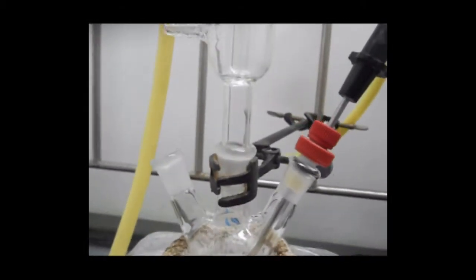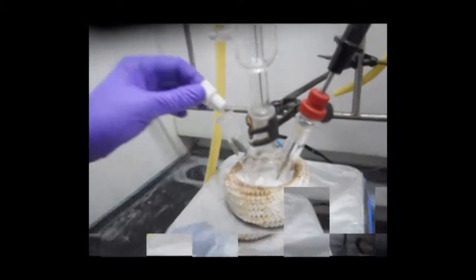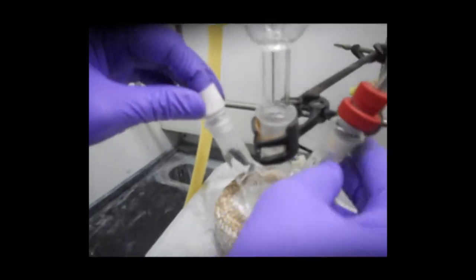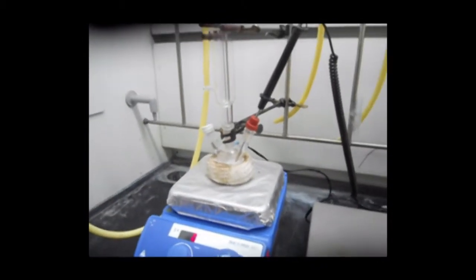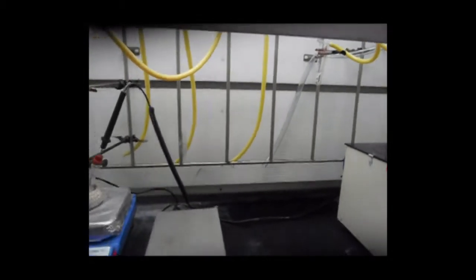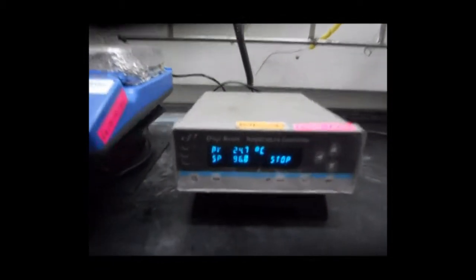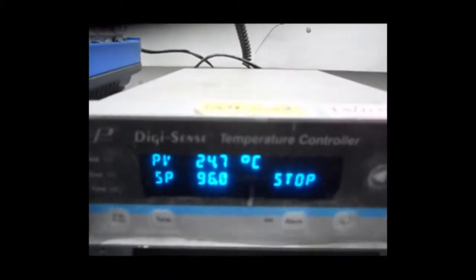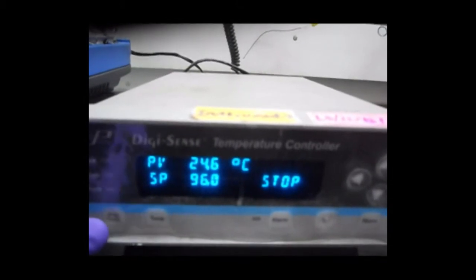Now the flask is set up and we pour out all the air from the flask. We set the temperature to 90 degrees centigrade. The instrument has been calibrated, so 90 degrees centigrade means 96 degrees centigrade on this instrument.